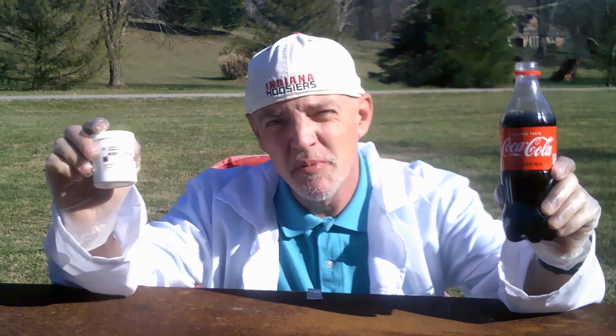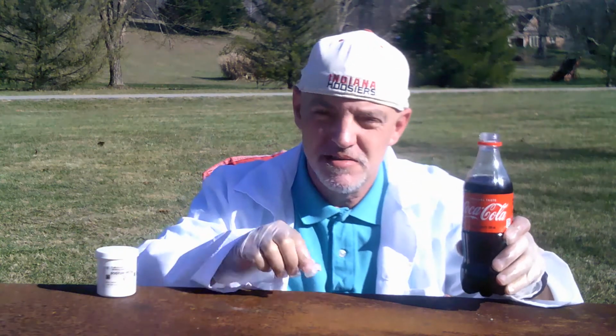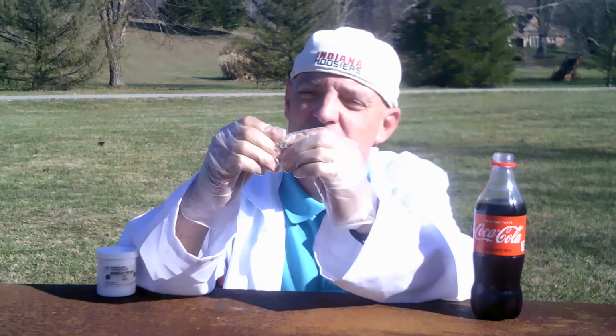Hi, today we're going to be doing a science experiment putting sodium metal into Coke. Sodium metal is very reactive to liquid. It's kind of like a clay texture, but you can mold it, and it's got kind of a shiny interior.